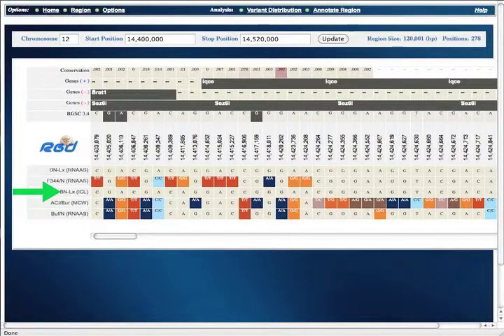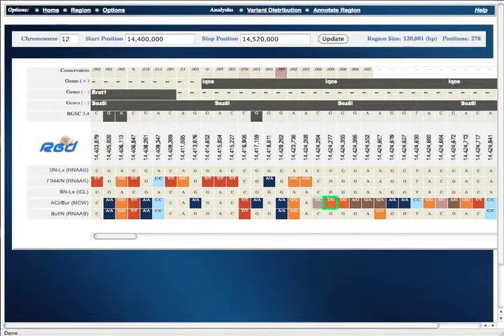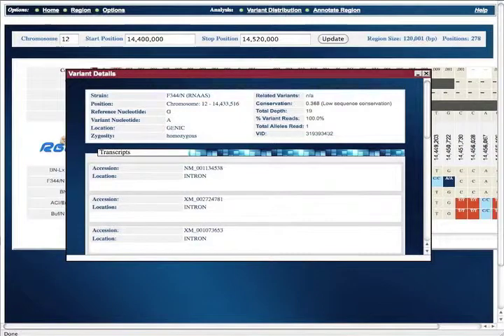The bases are color-coded by nucleotide, with adenine being dark blue, cytosine being light blue, guanine being orange, and thymine being red. The beige nucleotides represent spaces where there has not been a variant called for that position, either because the bases do not vary or because there was not enough data to declare said base to be variant. Heterozygotes are a combination of the colors of the 2 alternate bases. Selecting an individual base will display the variant details.